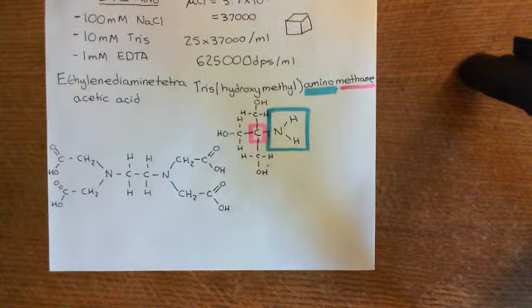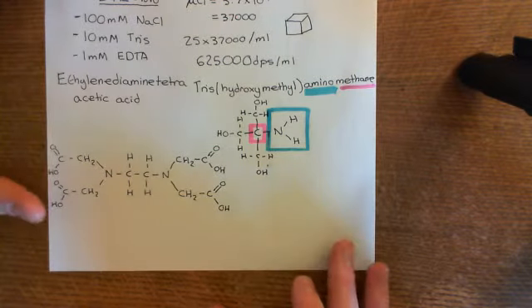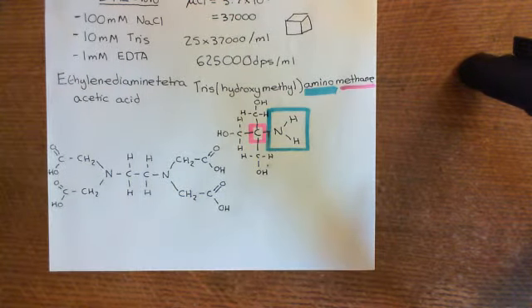Right, so those are the 3 things that you will have in the STE fluid. You'll have sodium chloride, 100 millimolar of that, 10 millimolar of tris, and 1 millimolar of EDTA. So it goes down nicely, dividing by 10 each time. Right, okay, so we've now rinsed off our solution containing the tritiated palmitic acid. What we're now going to do is lyse our cells open.